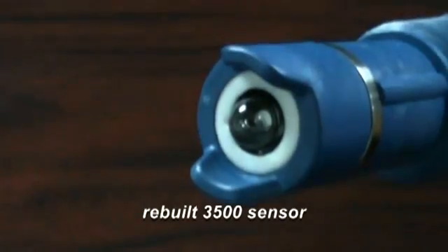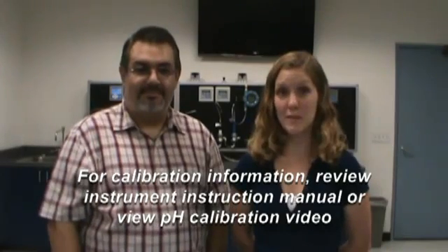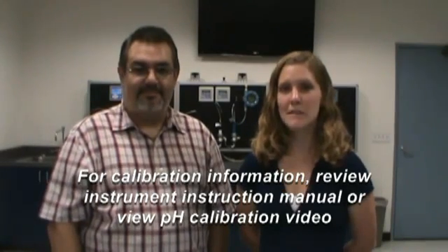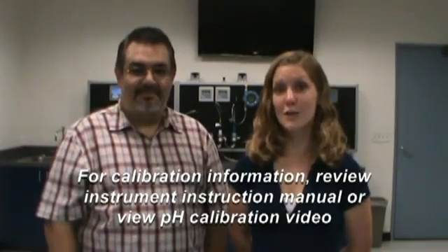This is how the sensor looks after rebuilding it. And that's how you rebuild a 3300HT, a 3400HT, or a 3500 PerfX sensor. Please remember, before the sensor goes back into service, you must recalibrate the sensor. For pH calibration information, please view your instrument instruction manual or view the pH calibration instructional video.